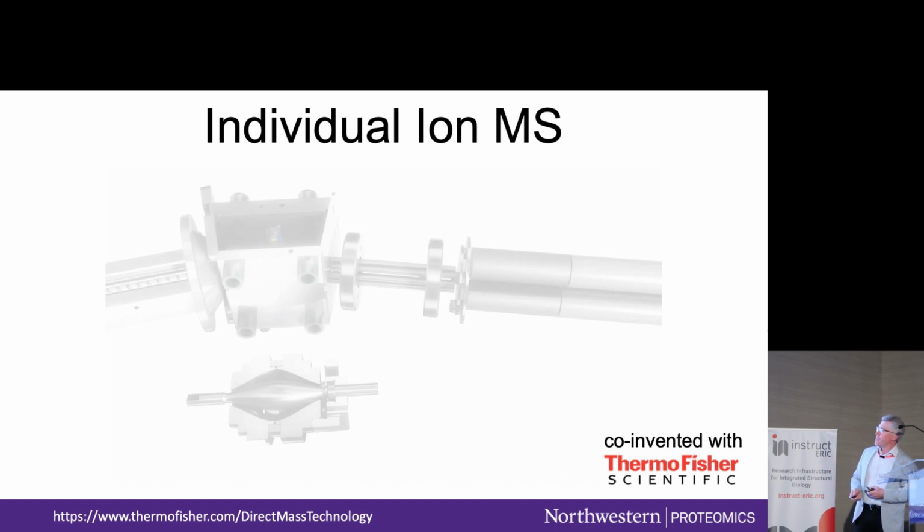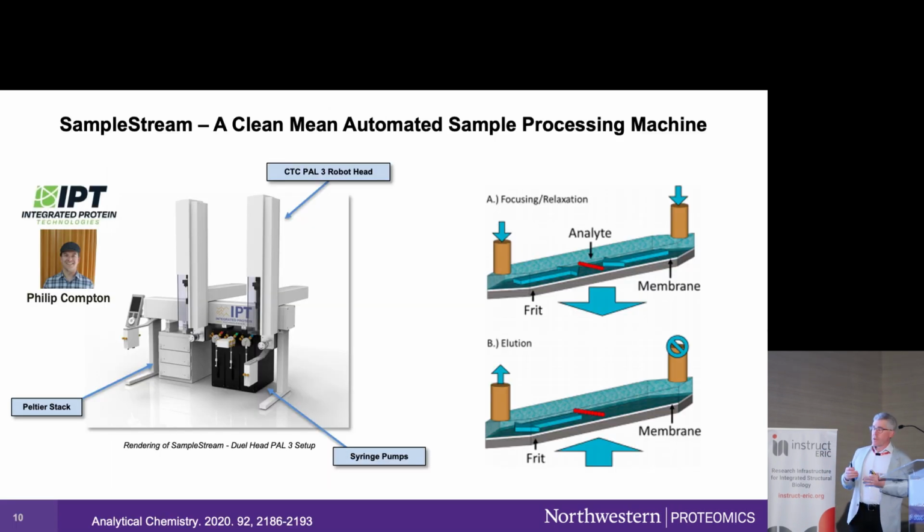Extrapolate the slope, generate your now mass spectra because we know the charge on all those ions. So mass to charge is frequency. Right, so that's as much as I'll tell you about the method, but it just has major ramifications. It's drastically accelerated what my lab's able to do, both because of the low abundance, required low amount of input sample. So we've combined this.